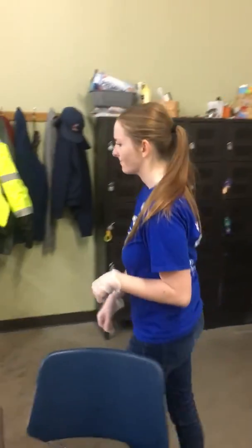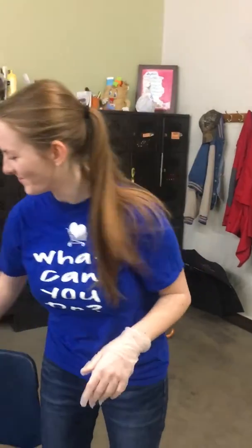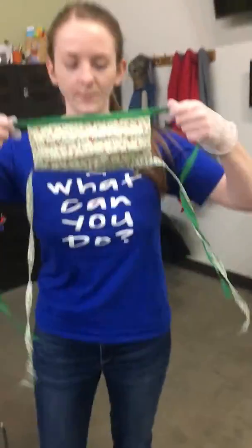Another don't is that your cell phone goes off and you have your gloves on and your phone's in your pocket and you pick it up and talk on the phone using dirty gloves. Before you answer your phone, remove your gloves, do hand hygiene, and then you can use your phone safely. Okay? And now she's going to put the mask on, and we're going to show you some don'ts with your face mask.